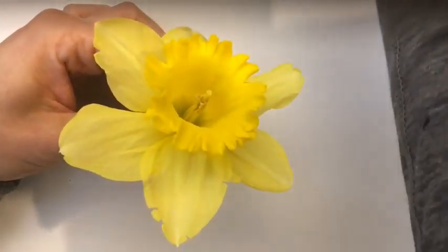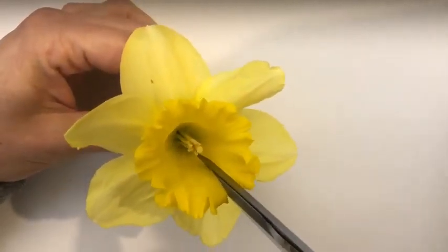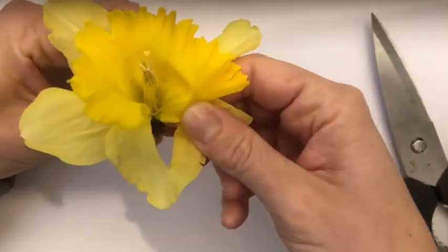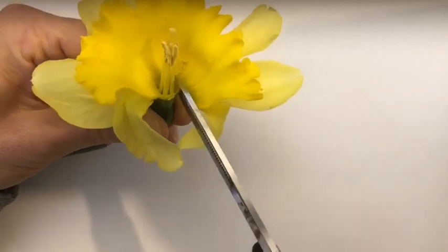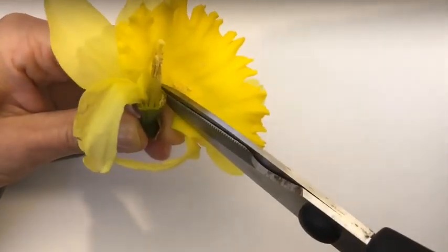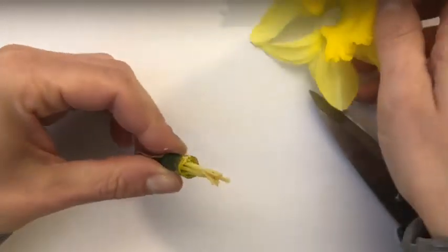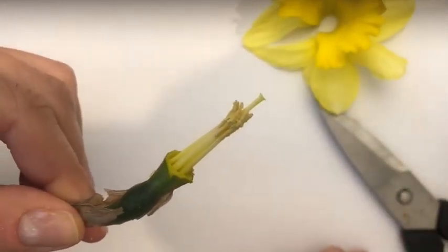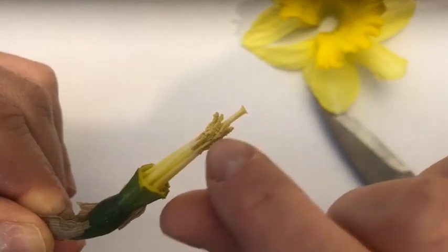I'm gonna take my scissors now and gently cut down the corona. I can even probably tear it with my fingers because it's so delicate. A lot of pollen is falling off. These are the reproductive organs of the flower. Again, the male reproductive part is called the stamen, and it consists of this long filament with the pollen-filled anther at the top.